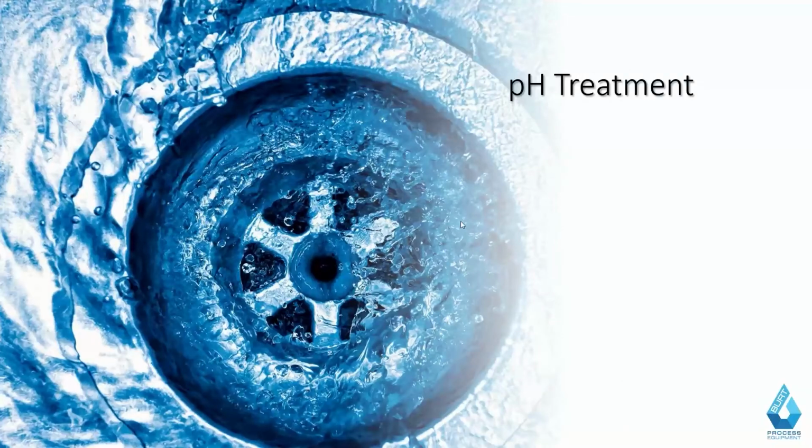Switching gears here at exactly halfway through the presentation. In addition to the process side, when you have any kind of lab space, you also need to look at pH treatment, because you're utilizing the high purity water in these cases. You're utilizing different machines, different experiments you have going on. Really, anything that generates or can contaminate water needs to go down, needs to be treated and monitored for use.